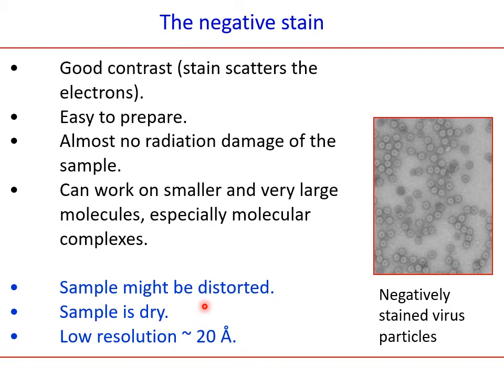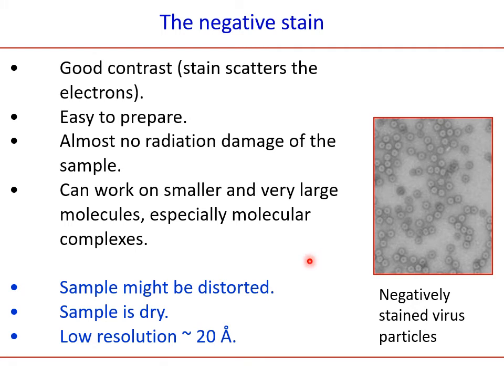In addition to drying, the specimen is exposed to vacuum conditions. When a sample lacking water is placed in vacuum, what is called a flattening effect occurs. For example, like a football with all the air removed placed in a vacuum chamber — it just becomes flattened. Similarly, a virus particle of spherical nature may lose its spherical shape and show a flattening effect, contributing further to a non-physiologically relevant structure.